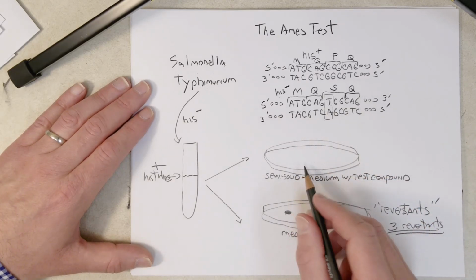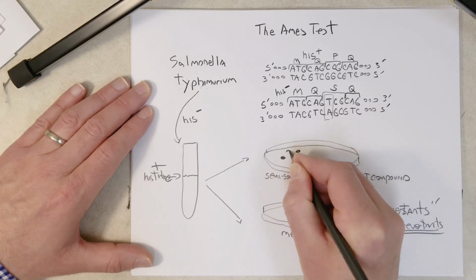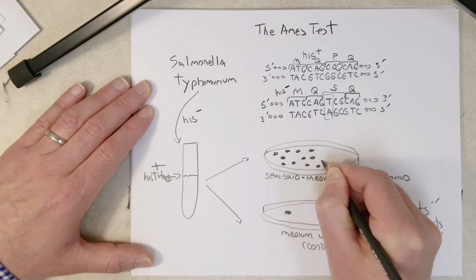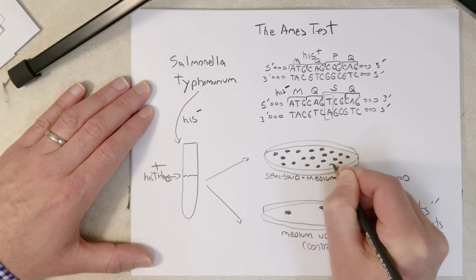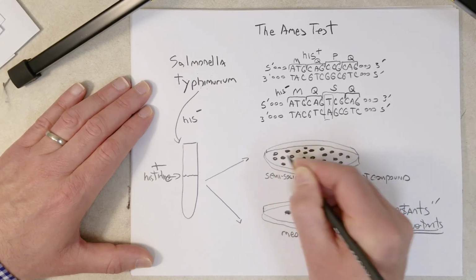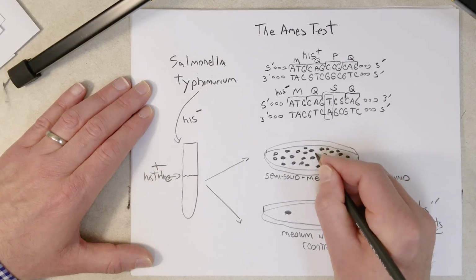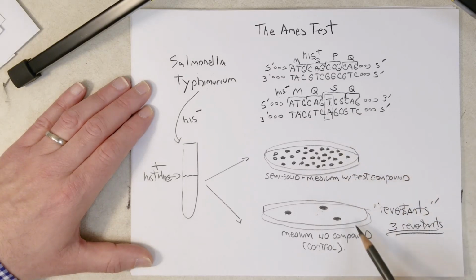So, okay, now let's look over here. Let's say in this plate we have many more colonies. Let's say, I don't know, 100. So this is where we'd have to get into statistics, right? We have to do replicates and compare the numbers to know that there are significantly more colonies on this petri dish than down here, or under this treatment than under this treatment.